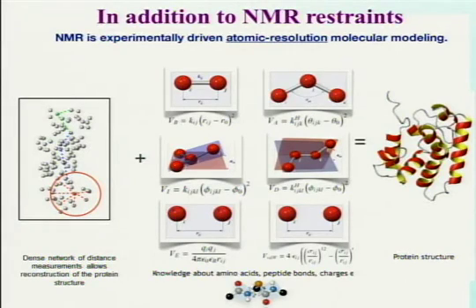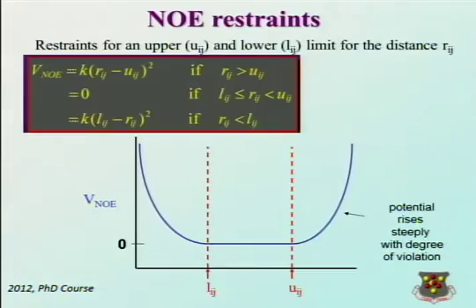or for some programs you may even neglect altogether some of the terms. For example, the Cyana program, which is one of the most popular ones, is completely throwing away the electrostatic interactions. They're just not represented in the program's simplified force field. So we are using a force field, but it's not complete, it's simplified. Simplified means we are taking into account a smaller number of interactions than the program should.